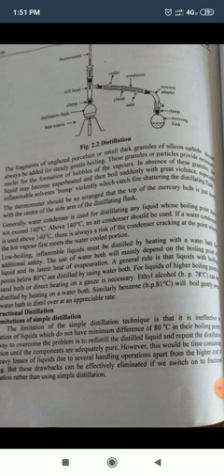The use of a water bath mainly depends on the boiling point of the liquid and its latent heat of evaporation. As a general rule, liquids with a boiling point below 80 degrees Celsius are distilled using a water bath.